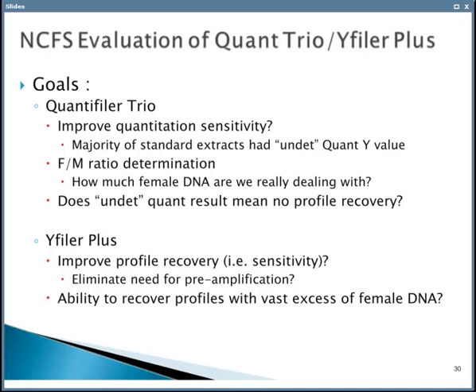That's an interesting question. And with the Yfiler Plus, could we get improved profile recovery sensitivity compared to previous, say, Yfiler? That would eliminate the need for pre-amplification. And could we recover profiles with a vast excess of female DNA?